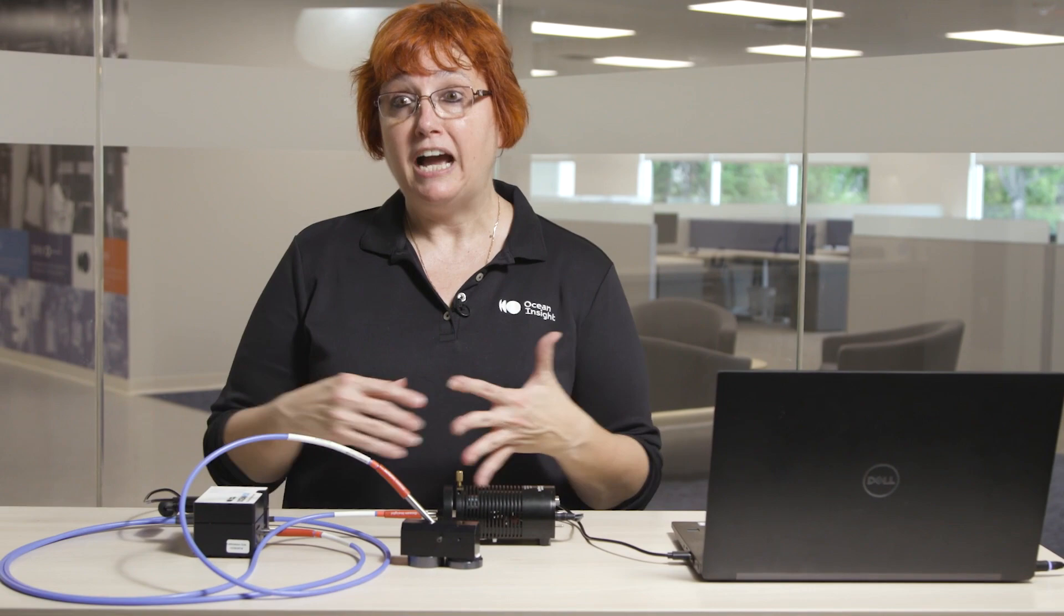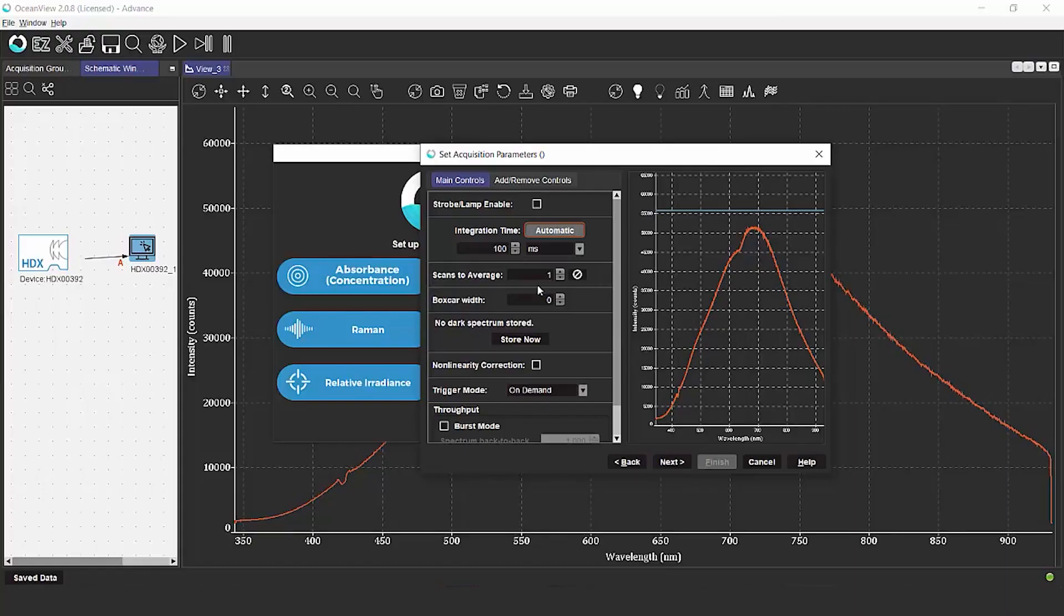In this case, at such a short integration time, I can do lots of scans to average. I'm going to start with 25, but I've done as many as several hundred, depending on how quickly I need to make the measurements.